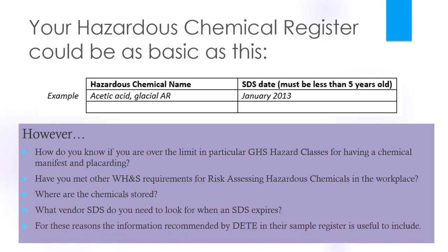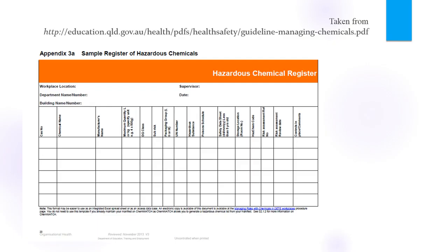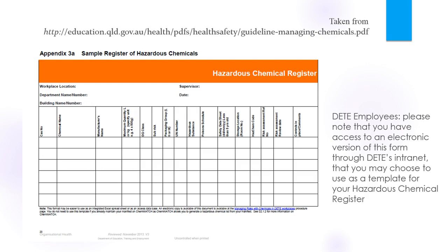What vendor or supplier SDS do you need in order to look up the SDS when it expires? For these reasons, the information recommended by DEET in their sample register is useful to include. As per the chemical manifest DEET, employees have access to an electronic version of this form and you may choose to use that rather than developing your own.